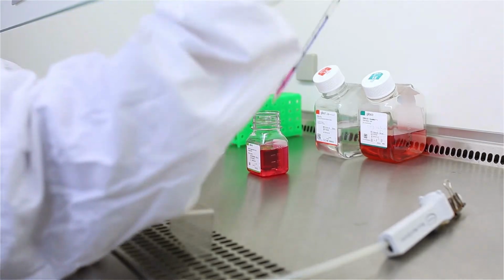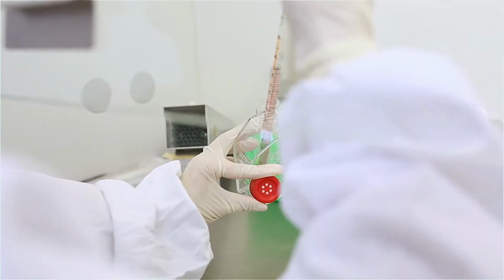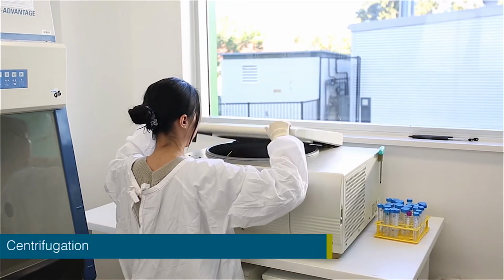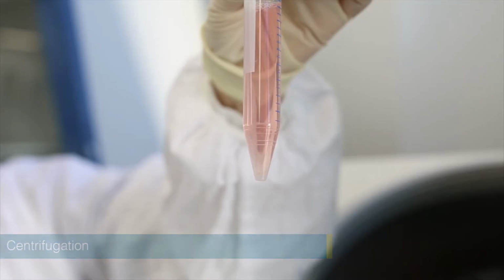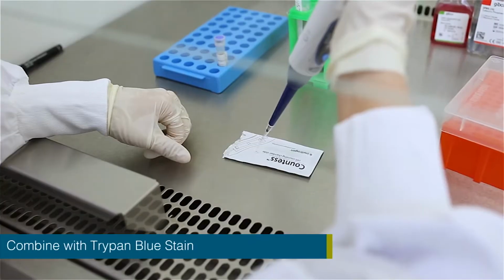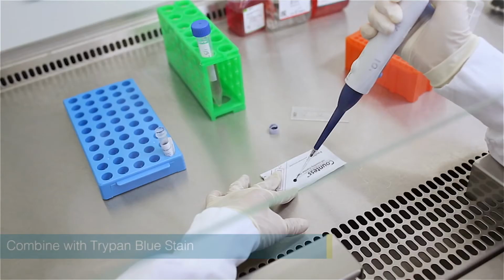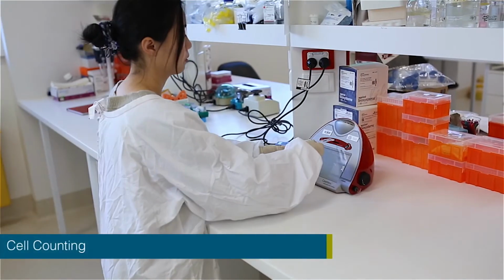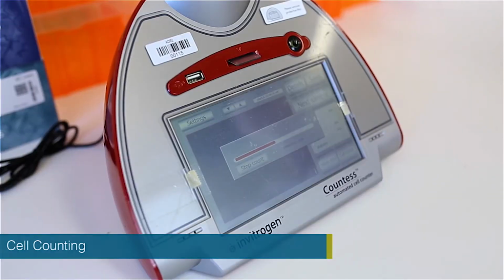Following trypsinization, the cell suspension is transferred to a centrifuge tube and subjected to centrifugation to pellet the cells. The resulting cell pellet is then resuspended in a small volume of growth media. A small volume of the cell suspension is combined with Trypan blue stain, mixed and loaded onto a cell counting slide. The cell counting slide is then inserted into an automated cell counter, which counts the number of cells on the slide and calculates the number of cells per mL of the original cell suspension.